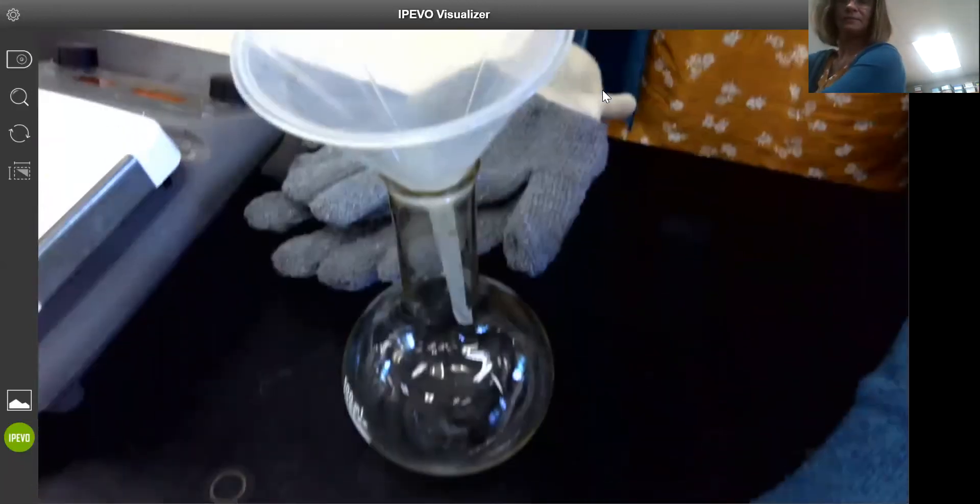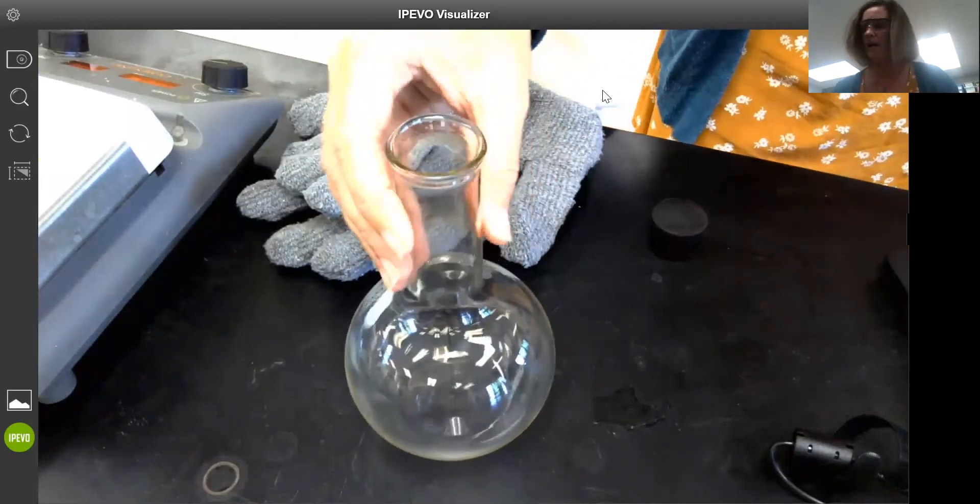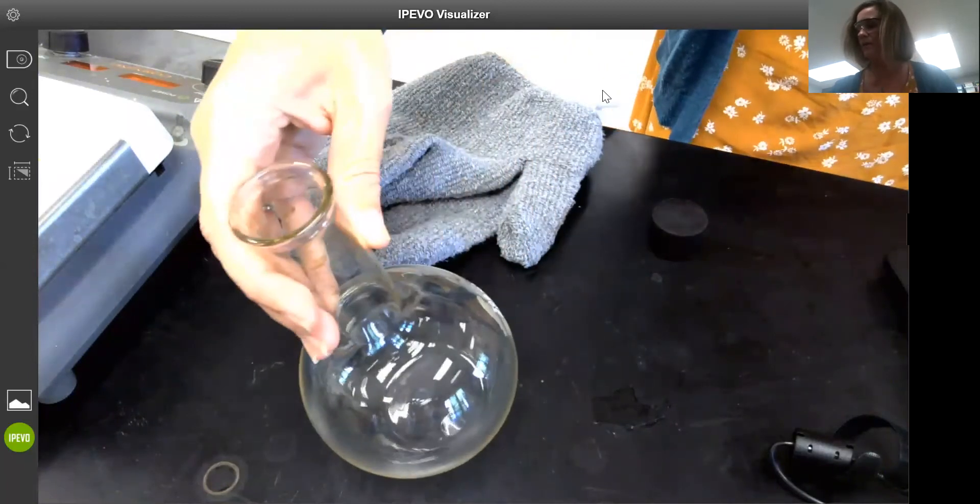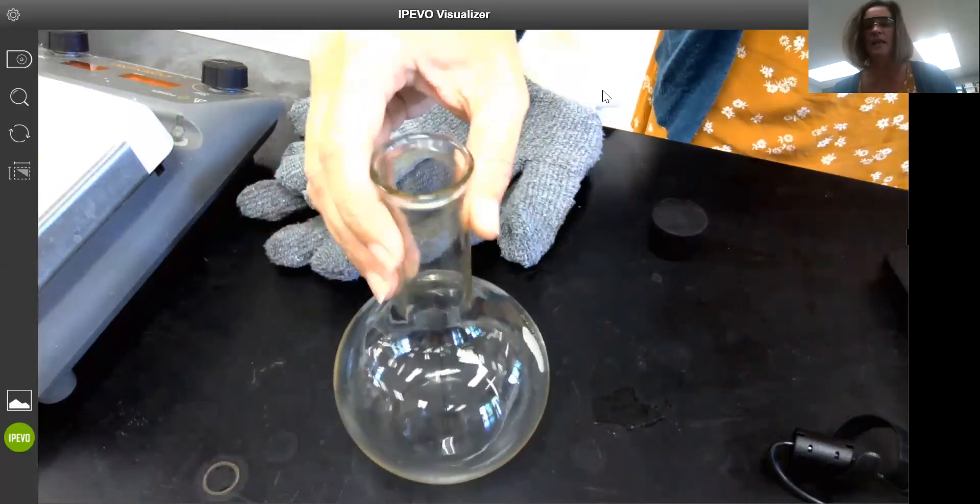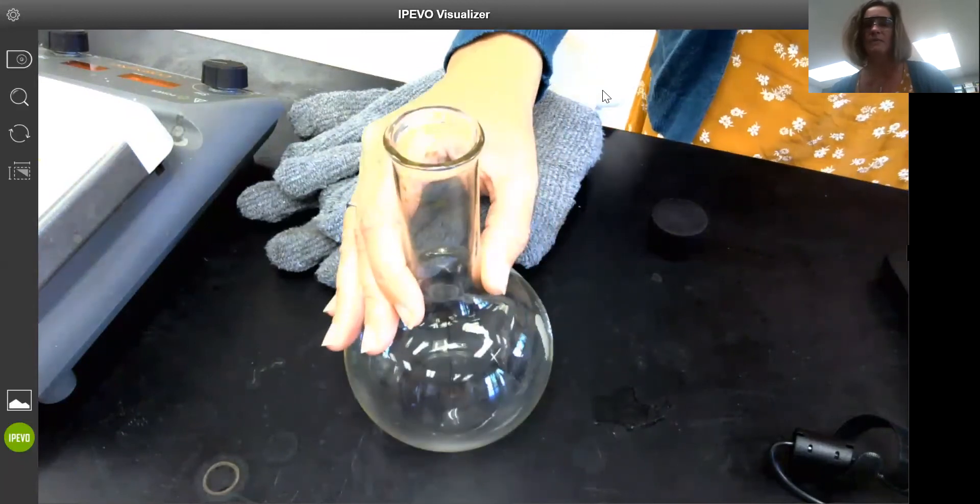This is called a Florence flask. It has a capacity of about 500 milliliters. It has a flat bottom, so you can see even though it looks round, it sits flat on the table.